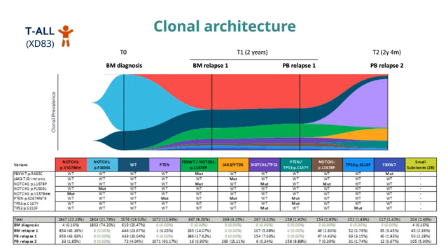Interestingly, again, this major red clone that is detected at relapse was already detected at diagnosis in a very small proportion, only 4 cells, but it was already there. And then we also see a collection of clones appearing in this relapse sample, and again, the composition is very similar in bone marrow and blood at relapse.